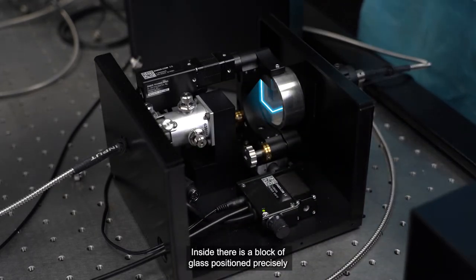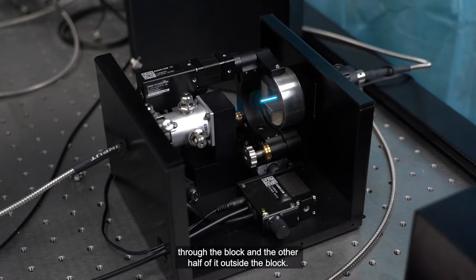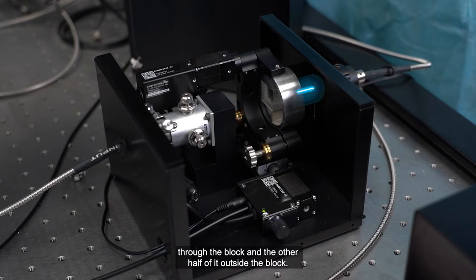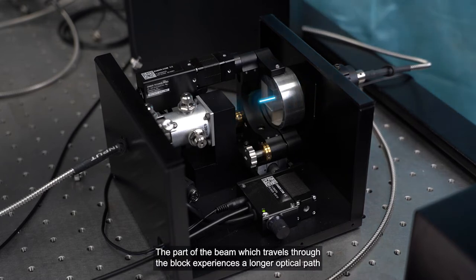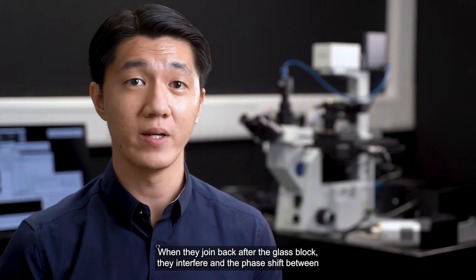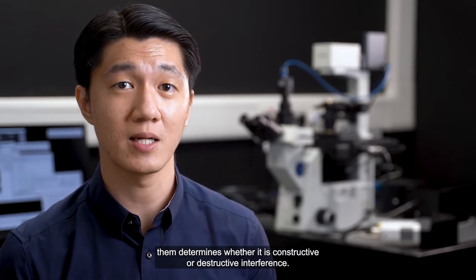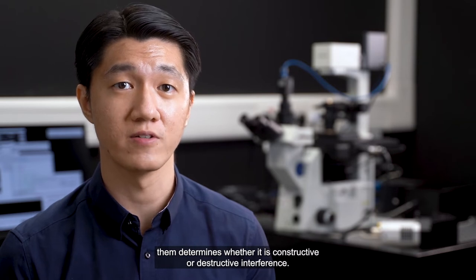Inside, there is a block of glass positioned precisely in such a way that half of the beam propagates through the block and the other half of it outside the block. The part of the beam which travels through the block experiences a longer optical path, and is therefore phase shifted compared to the other half. When they join back after the glass block, they interfere and the phase shift between them determines whether it is constructive or destructive interference.